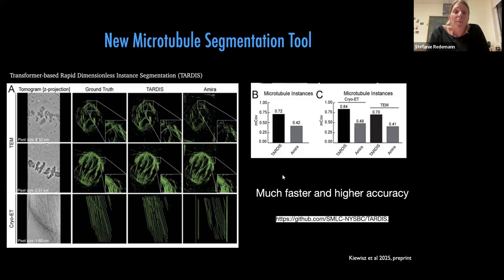And so we are basically much, much faster in now segmenting all the microtubules in our individual tomograms. At this point, it doesn't take several days, but often can be achieved in an afternoon. And you can envision that this really is a big game changer.